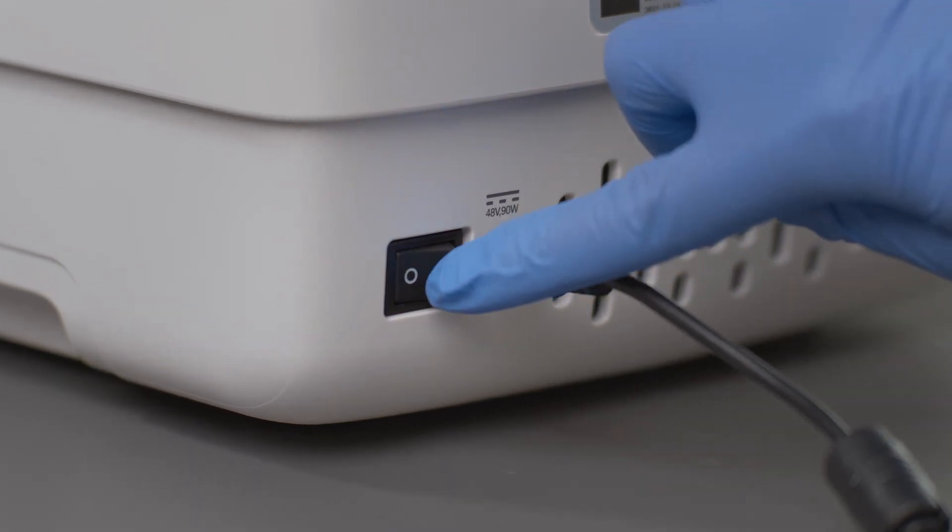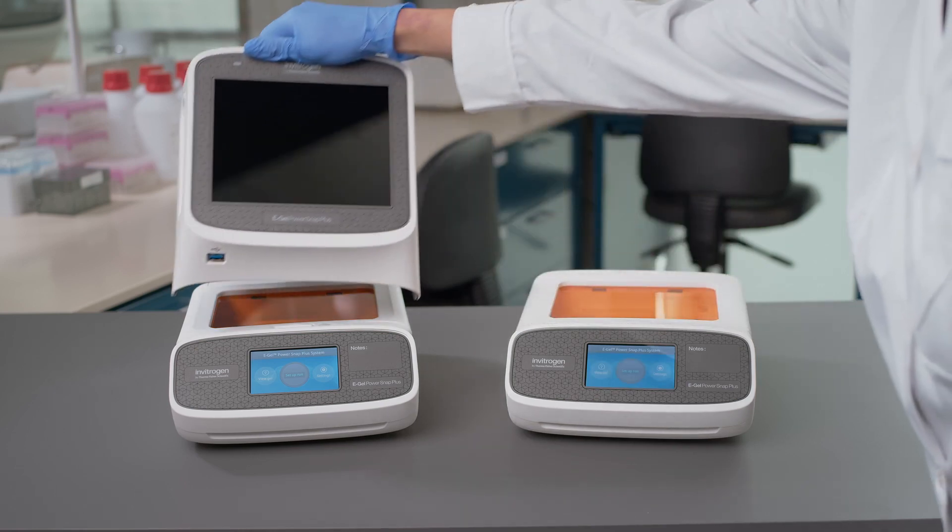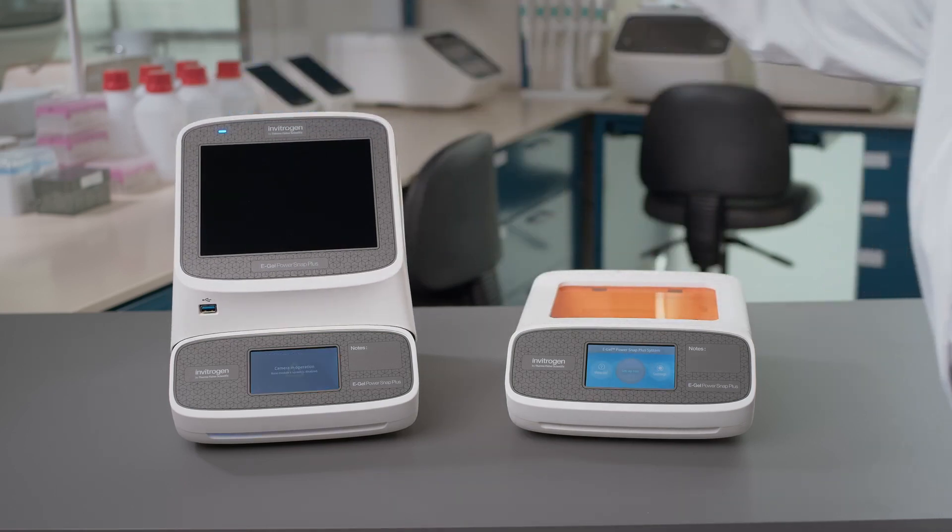Turn on the master switch located at the back of the device. Power up the camera module by placing it on top of the electrophoresis device.